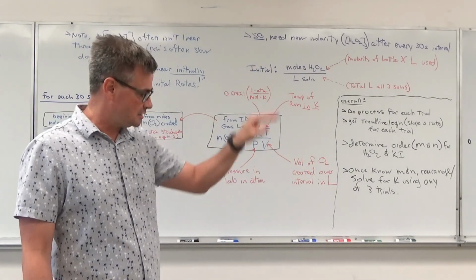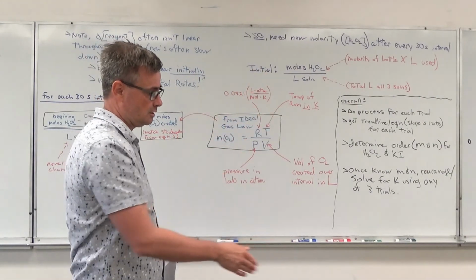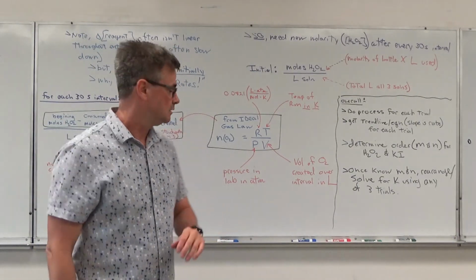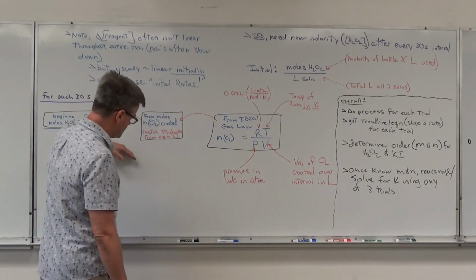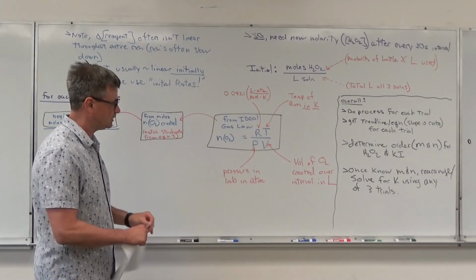Or is it some crazy number? Okay, and see that you transposed your formula all the way down the column for all your intervals. Okay, and in general, once you do your scatter plot, it should be just like the sample data that I sort of tried to describe. It should have a downward slope. The concentration of your hydrogen peroxide is going down. Okay.